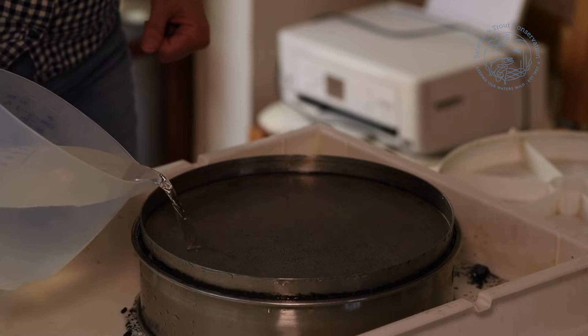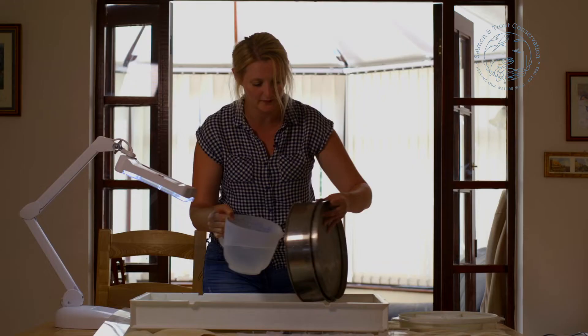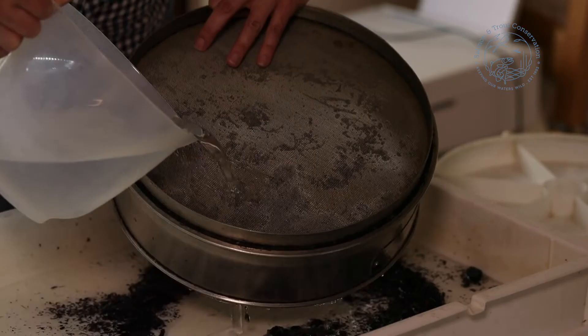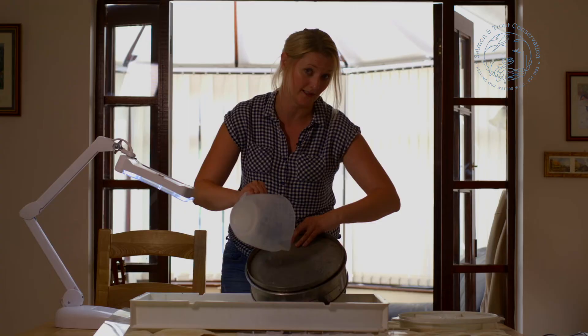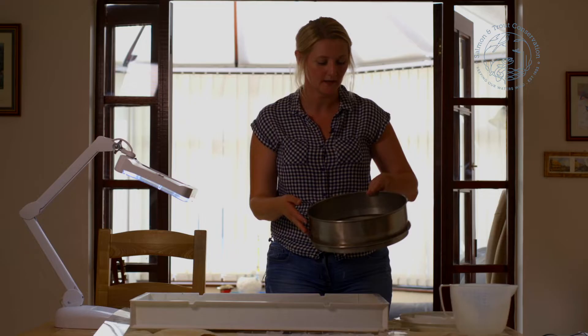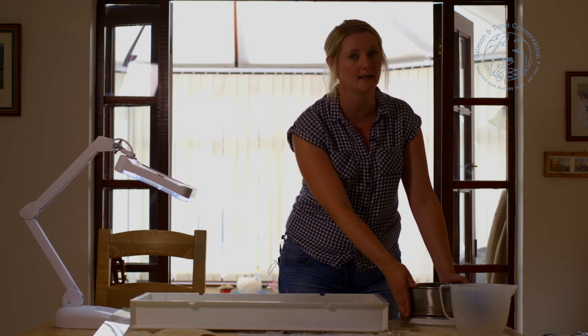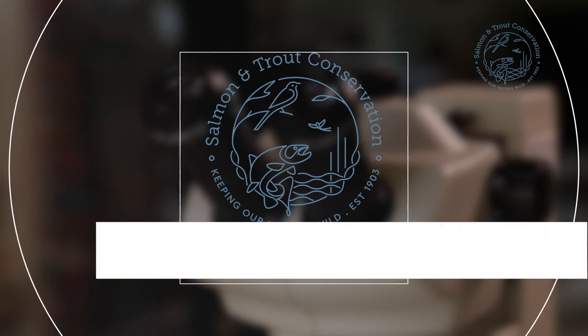Make sure that you cover all of the area of the sieve — that will get most of the matter out, but as you can see there's more in there, so you're going to have to go through a process of carefully rinsing through the sieve until you've got all of your sample out into your tray. I've made sure that I've got everything out from all the corners, and I've put it back on the white tray just in case anything has slipped through.